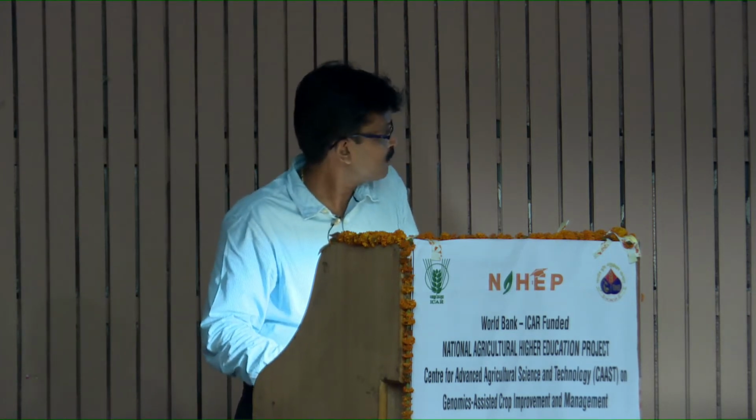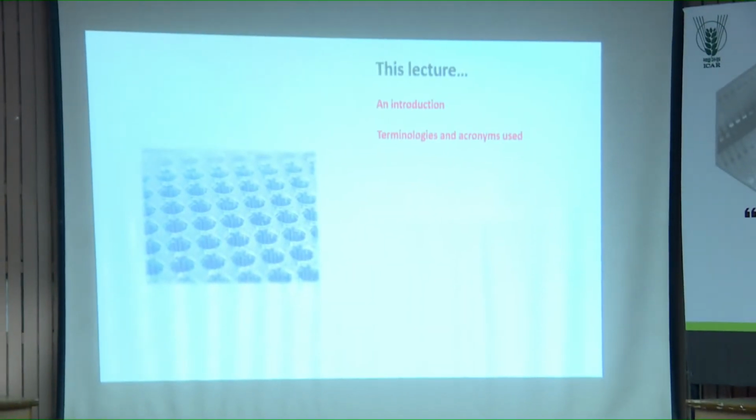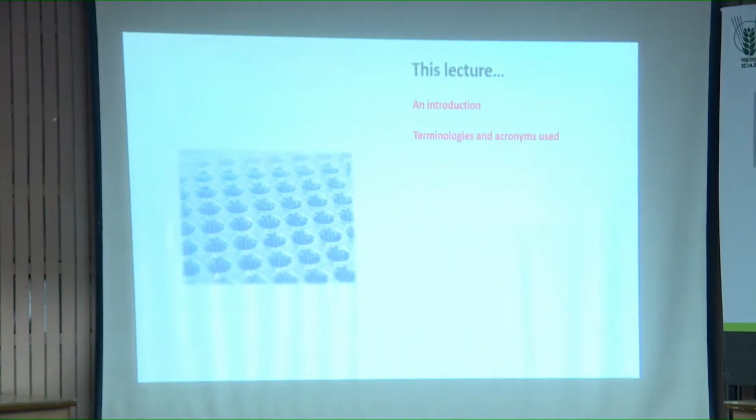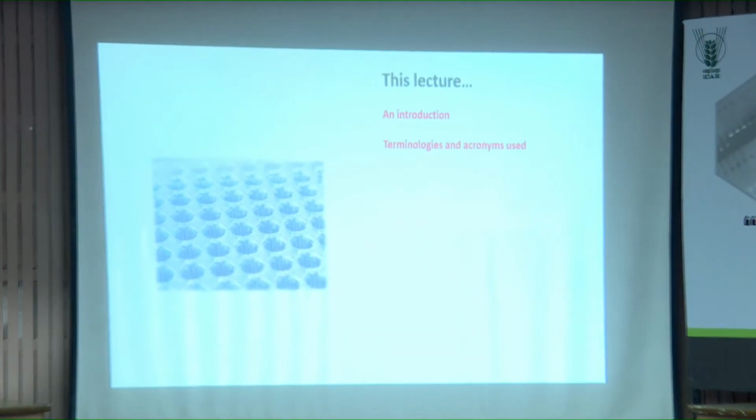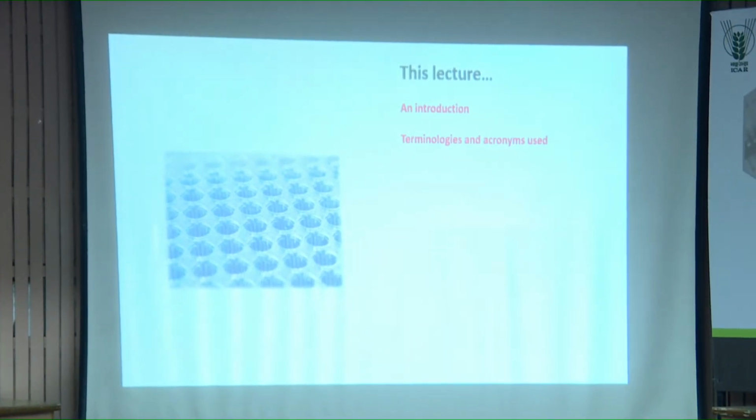In this lecture, I will give a brief introduction about this qPCR and the terminologies and acronyms used. If you read literature about real-time PCR, you frequently come across real-time PCR, quantitative PCR, quantitative real-time PCR, right?